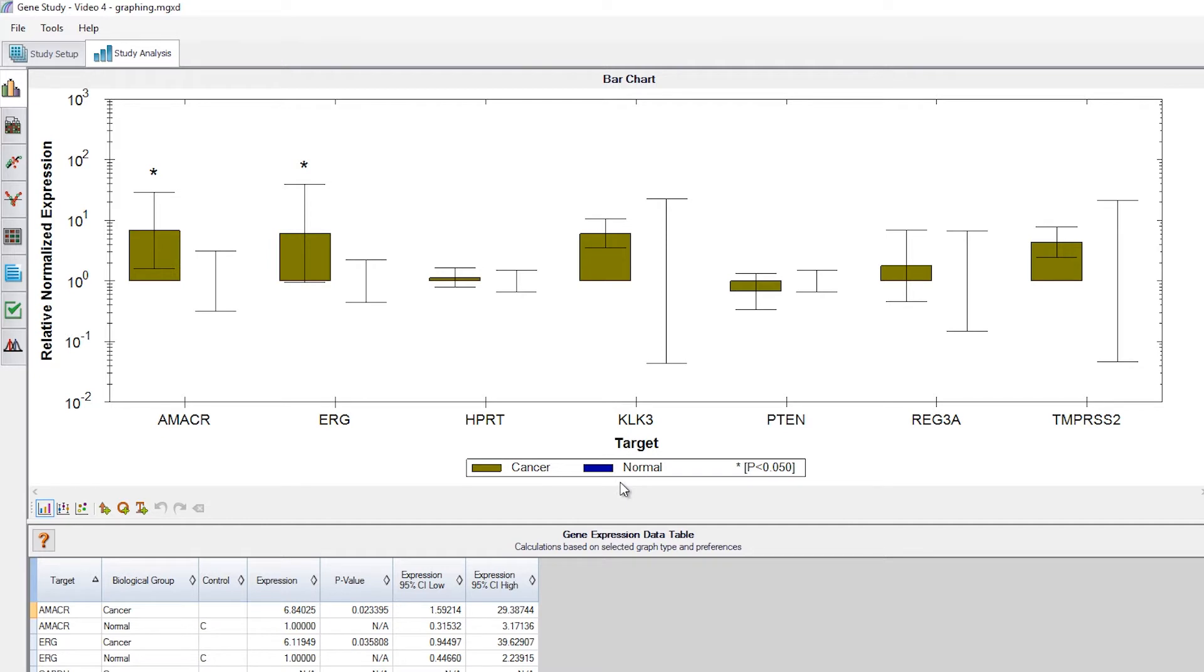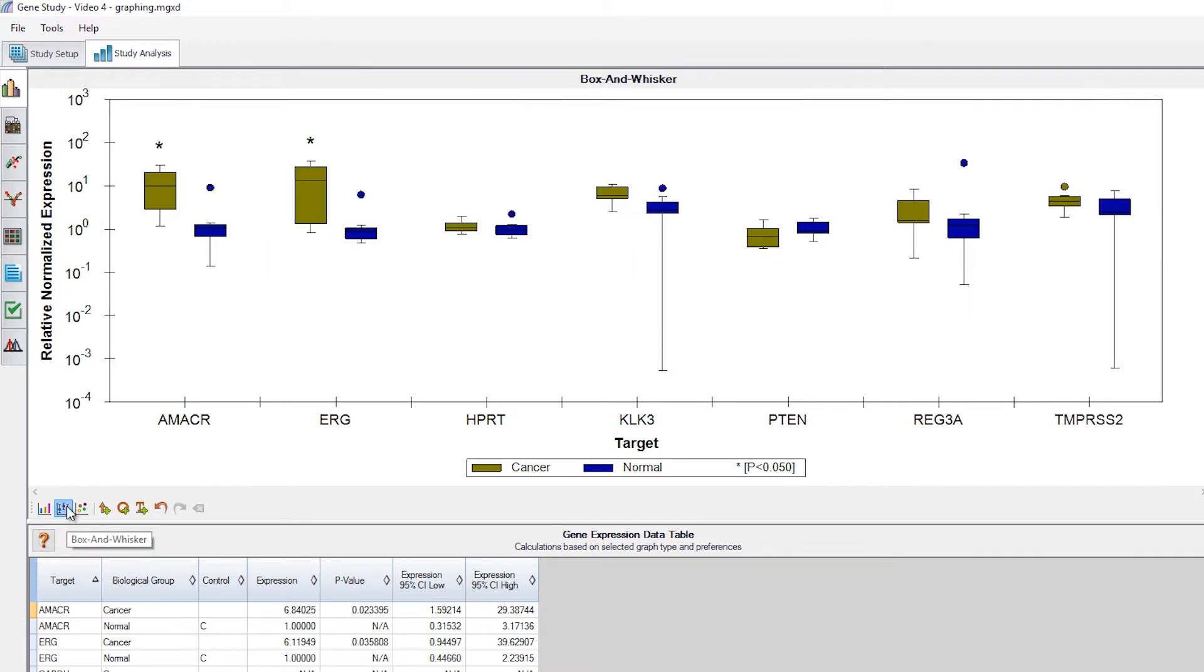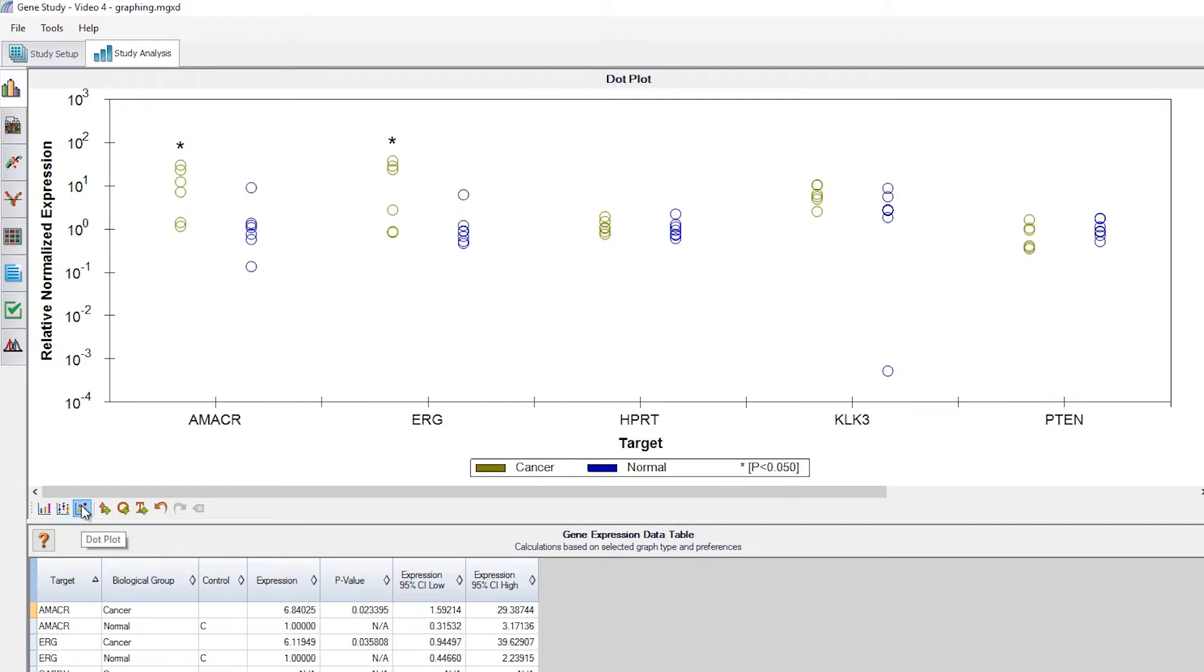Within this main graphing window are several small icons in the lower left. These represent different ways to view our data. There is the standard bar graph view, a box and whisker view, and a dot plot.